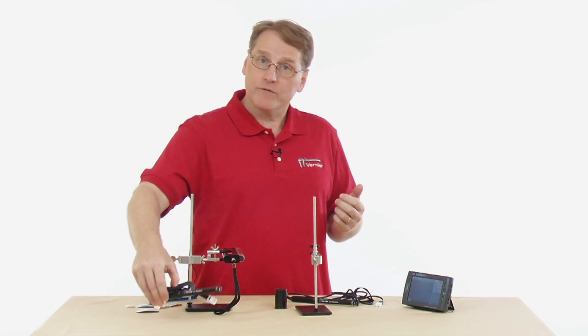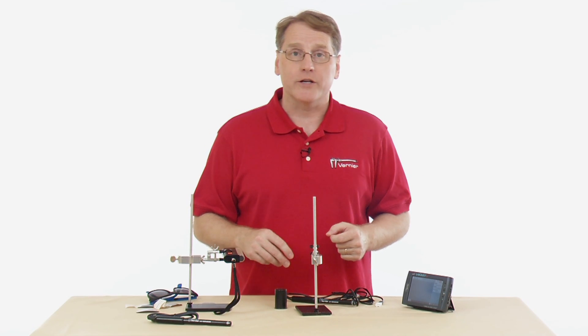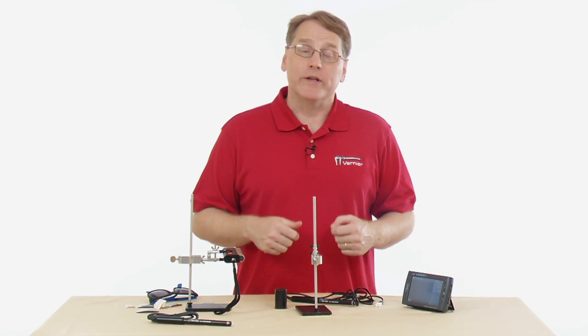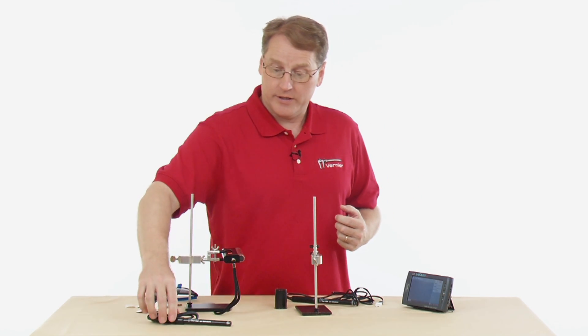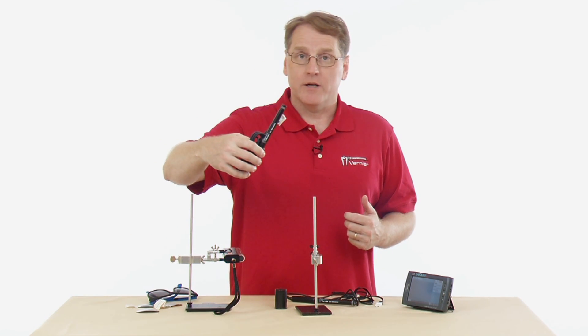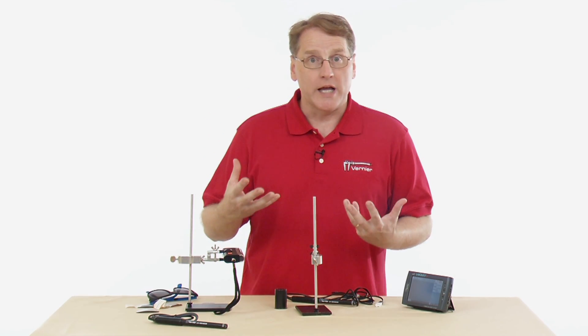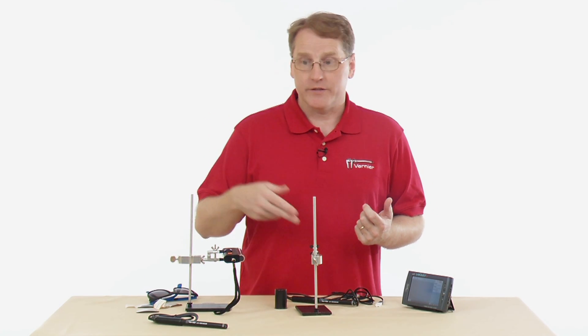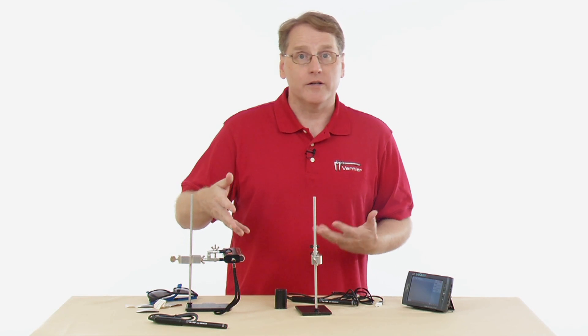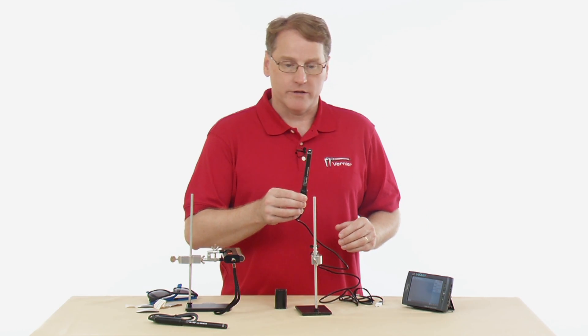The reason there are two sensors depends on your source of UV radiation. If you're using sunlight, it tends to peak more in the UVB range, so that sensor is better suited for outdoor use. If you're using an indoor source of UV radiation, such as an ultraviolet black light, you would choose the UVA sensor.